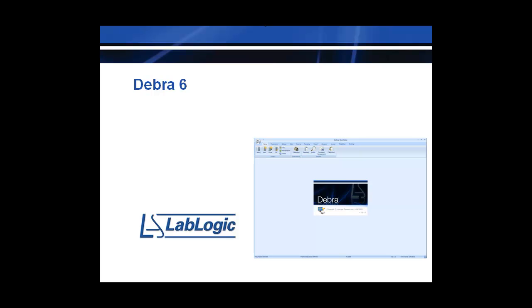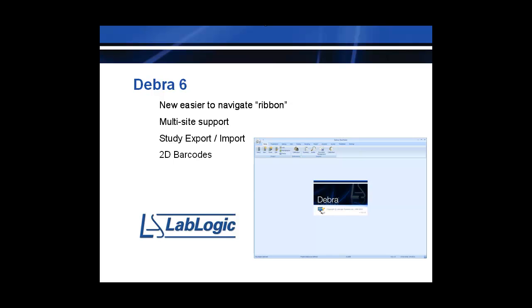Debra 6 introduces many new features, including a new user interface, multi-site support, study export and import, the addition of 2D barcodes, the merging of our Sarah LIMS, and a major technology update. Let's look at each of these new features in more detail.